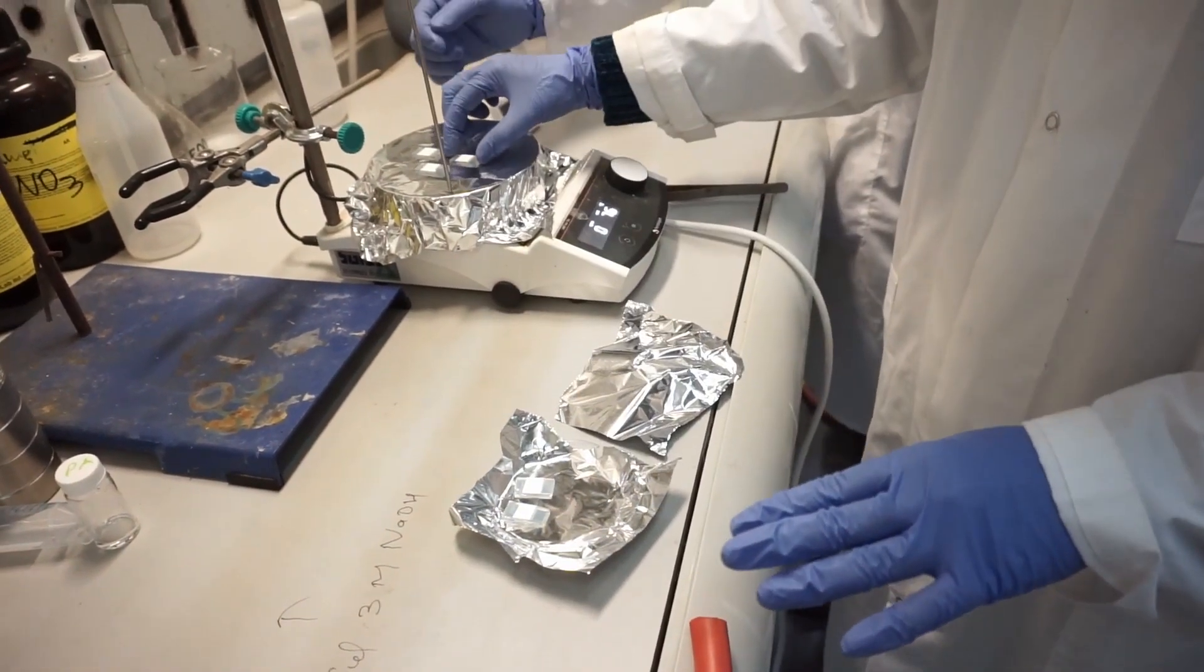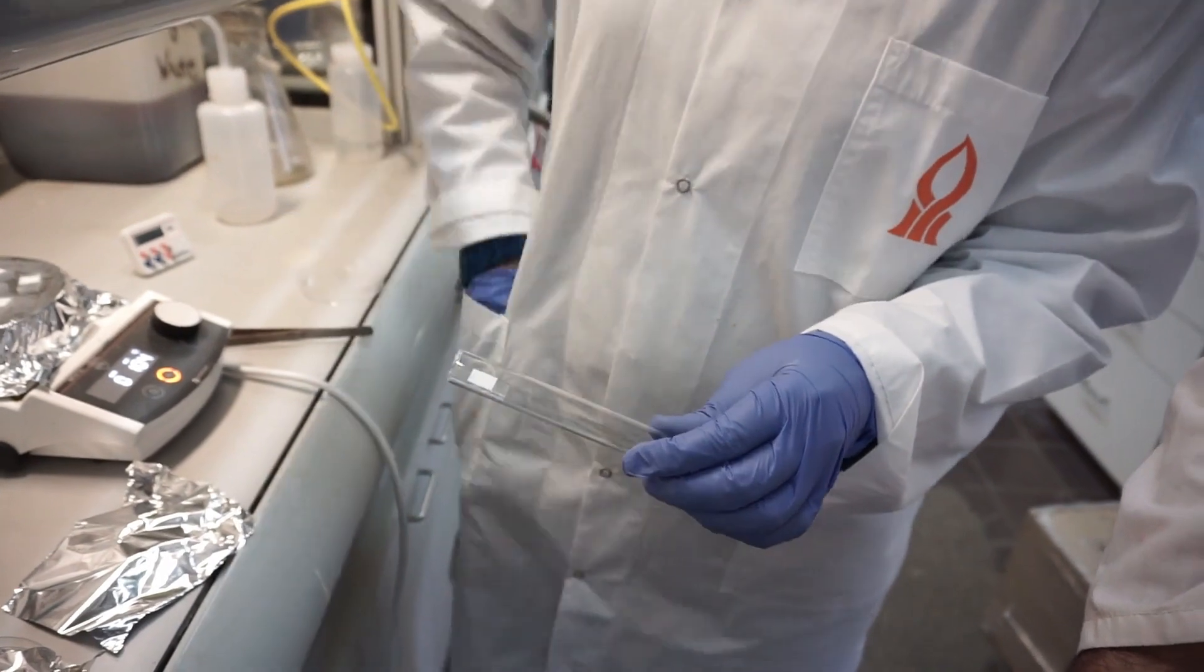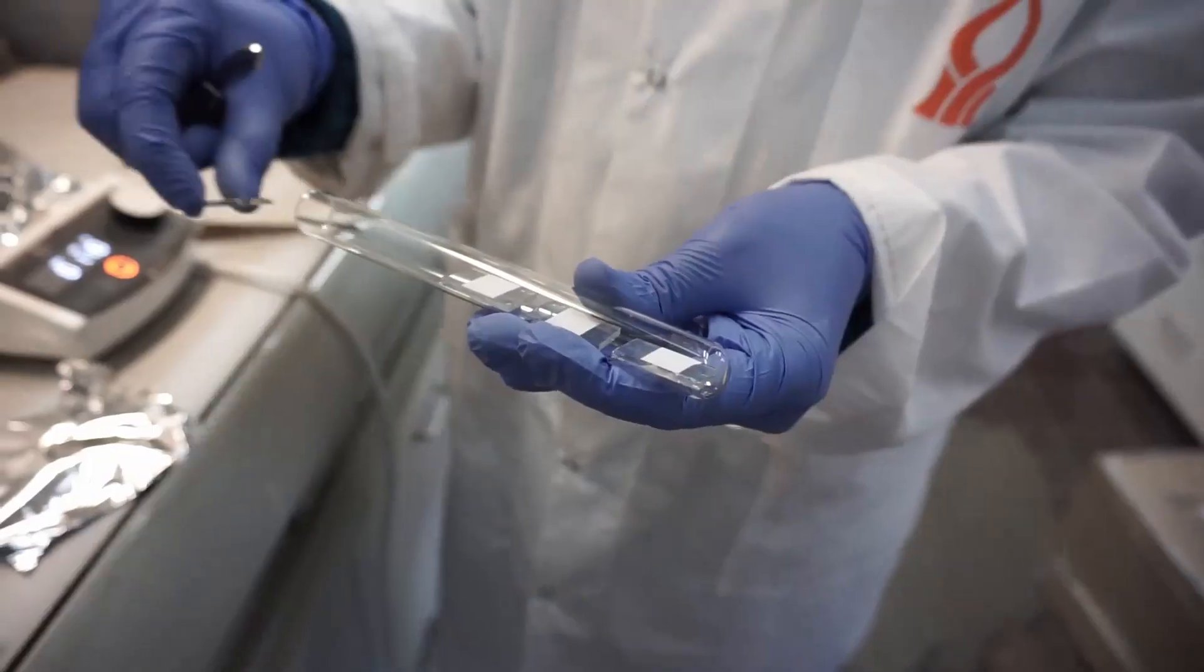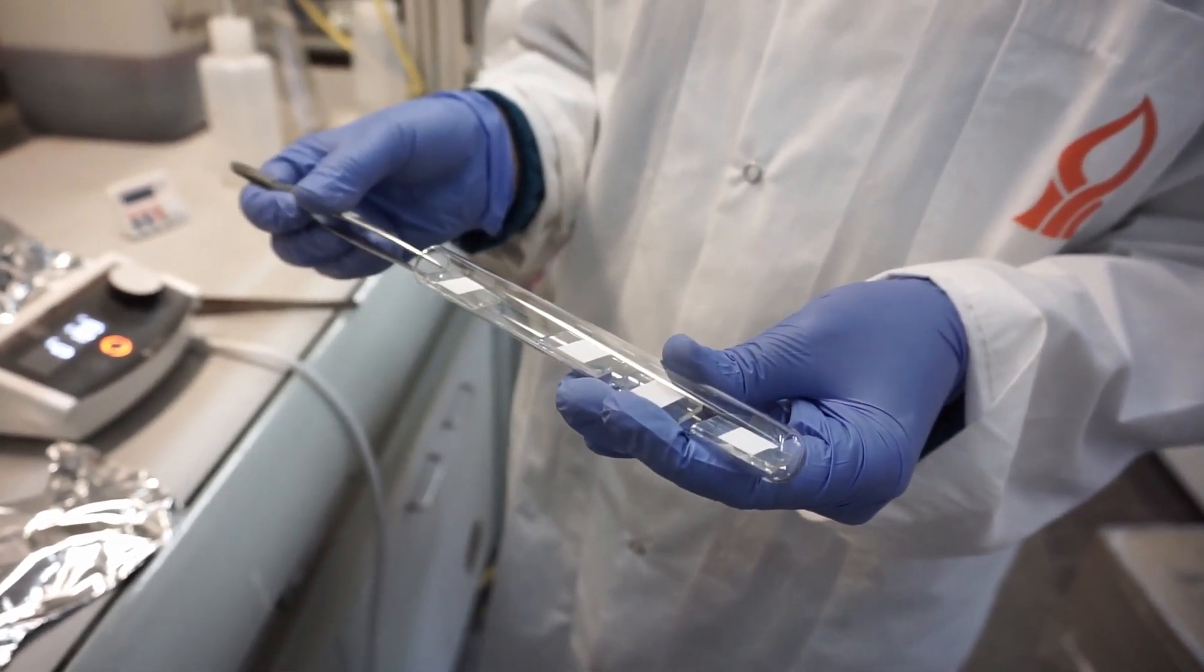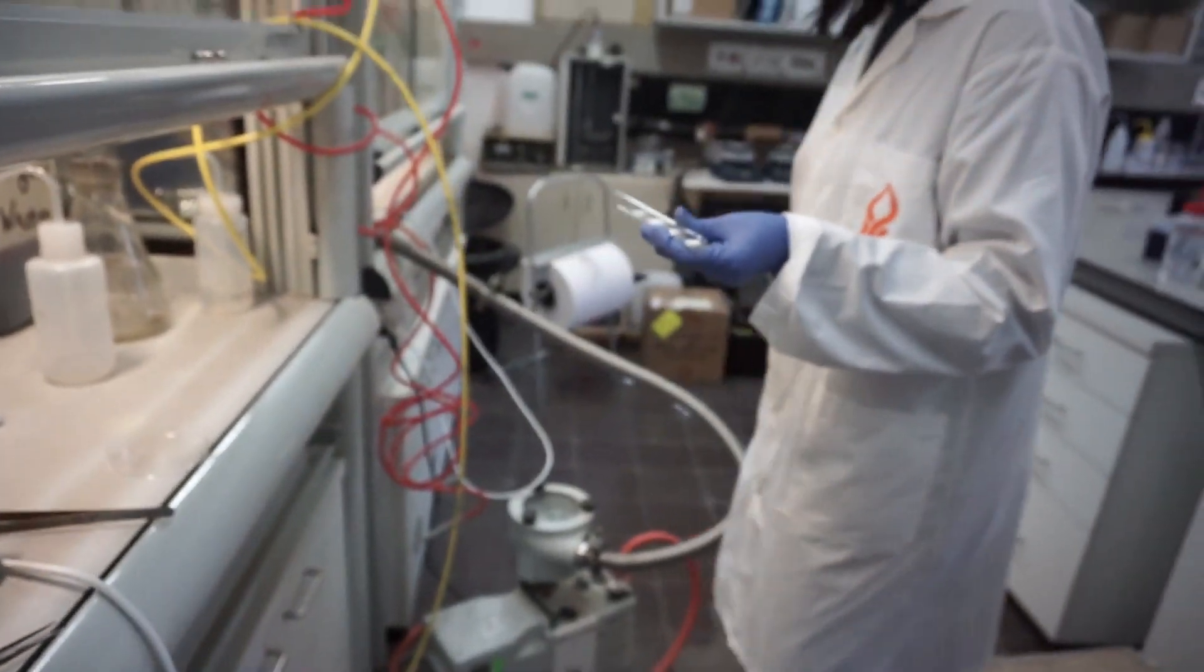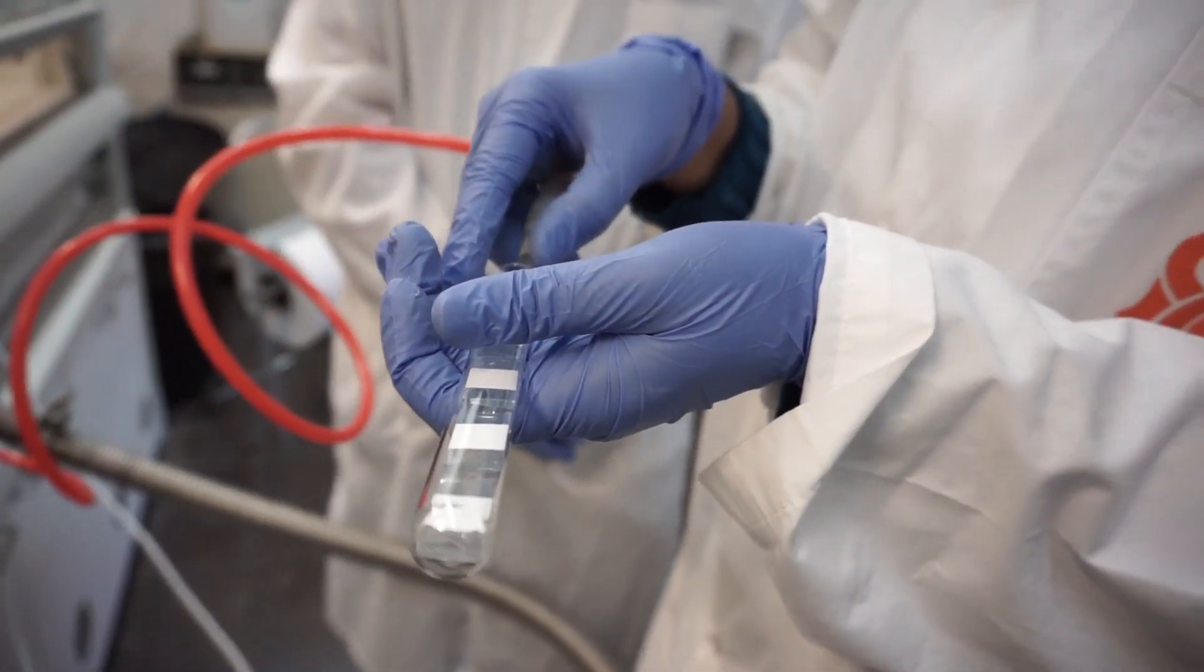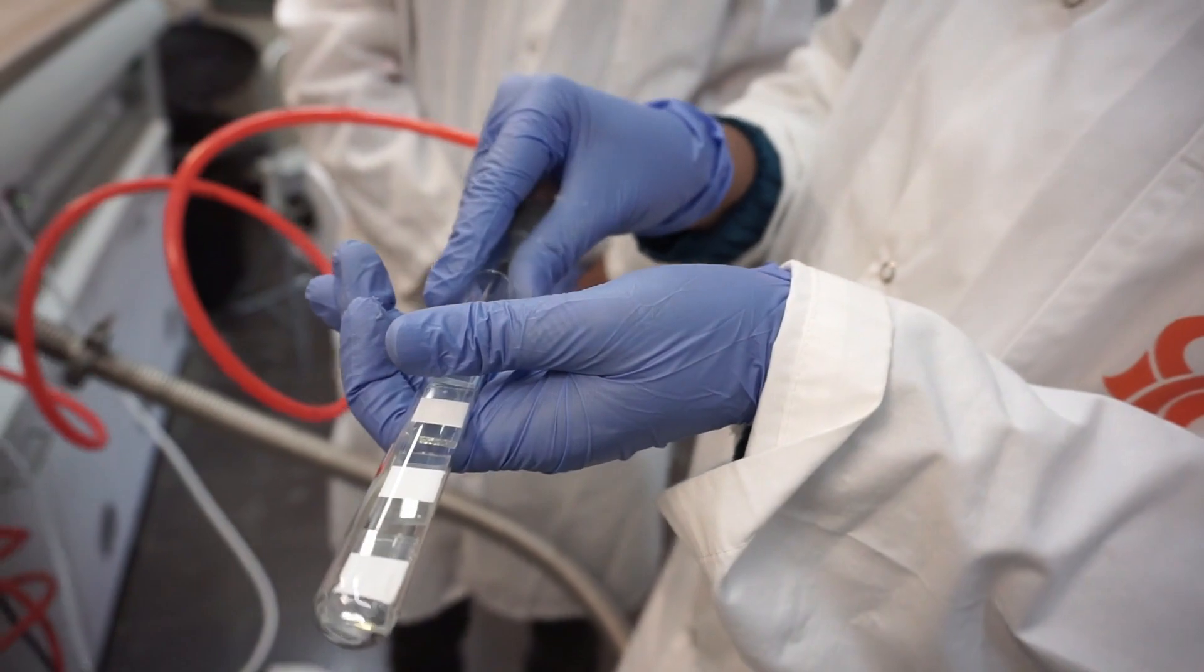You can prepare your samples for a thermal treatment in an inert environment by placing them in a test tube. We then purge the test tube with a flow of inert gas for about 3 minutes. This will ensure little to no oxygen gas will remain in the tube.